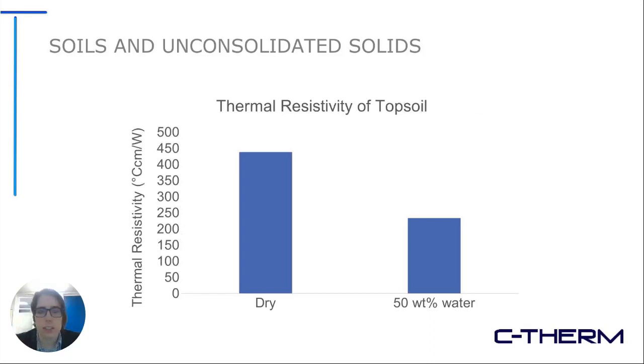And this is looking at the IEEE standard, looking at the thermal resistivity expressed in degrees Celsius times centimeter per watt of the topsoil. Again, looking at the dry and also the wetted topsoil material.